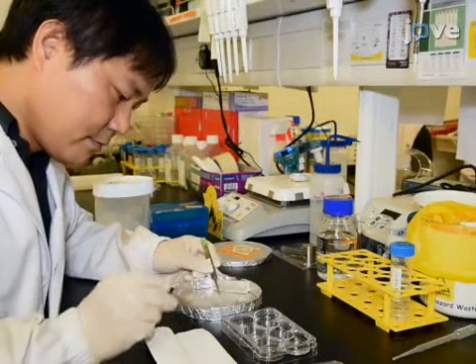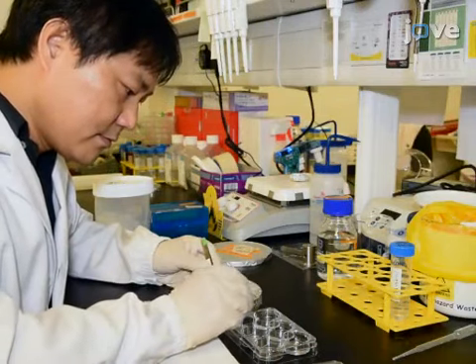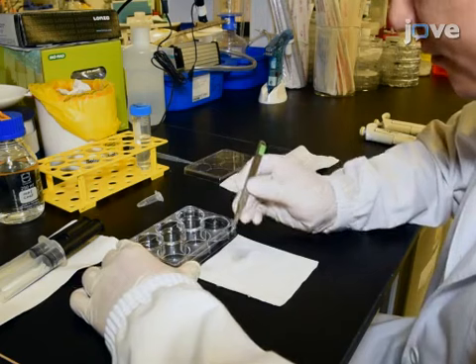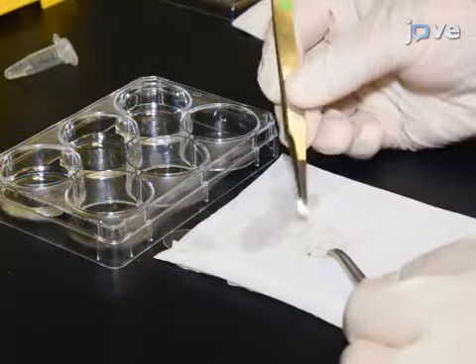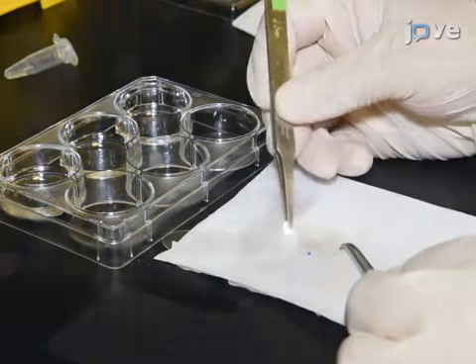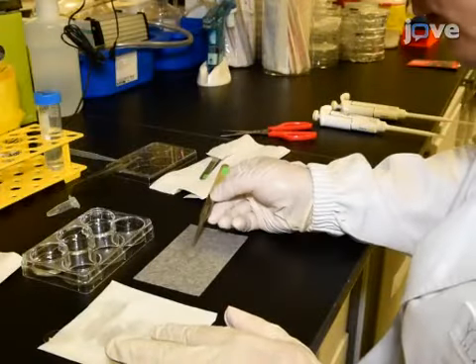Begin this procedure by preparing the cells on cover glasses in a 6-well plate. To assemble the imaging sample, use fine forceps to gently remove the specimen cover glass from the buffer well. Then quickly and gently tap away excess buffer by touching the edge of the cover glass with folded absorbent paper. Place the cover glass cell side facing up on a piece of clean lens paper.